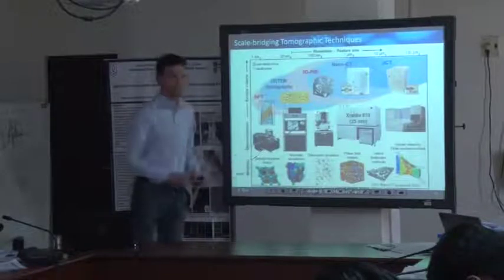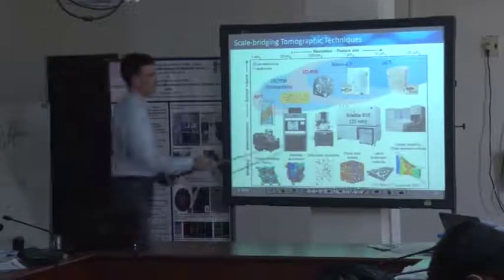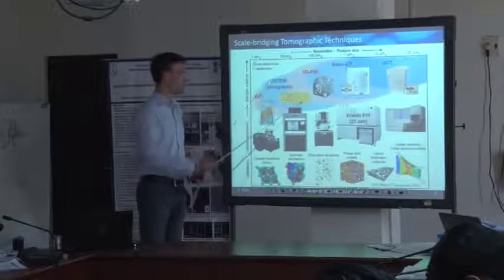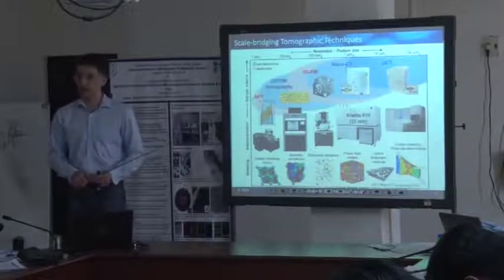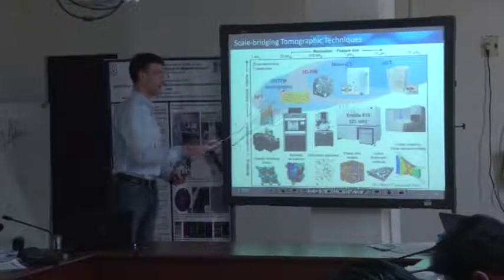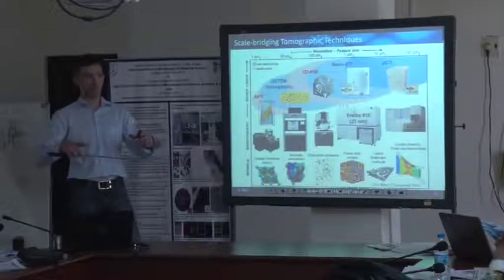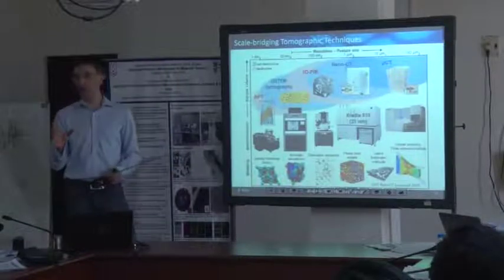Now we have the focused ion beam available, and we already saw some of these sectioning tomographs in the fifth session, where we end up with a 3D resolution of down to 1 nanometer. And I would like to show you that with scanning as well as transmission electron microscopy, we are nowadays able to go down to the atomic scale, so you can do 3D analysis on the atomic scale. But you can also go up to sample thicknesses even of a few micrometers. So you can start from a few micrometers cubed down to only very few nanometers if you think about nanoparticles.